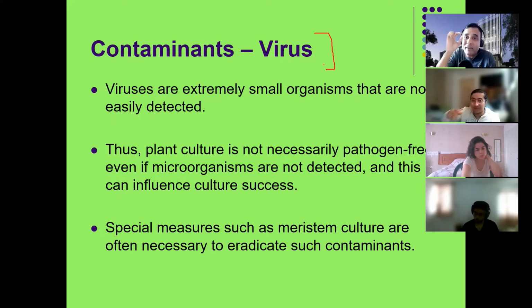On the apical meristematic tissue, or the bud, you have to cut the smallest part of that bud, a major part of which must be meristematic tissue, meaning no vascular system. Since it is not connected with the vascular system, the virus, even if the plant is infected, is not in that tissue. In some cases, people take the tissue to an electron microscope laboratory to see whether they observe any virus particle. Or they take out the DNA from the starting material and check by genomic sequencing for any sign of pathogenic viruses. So that is another way.